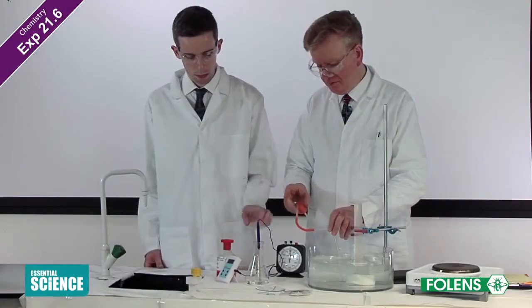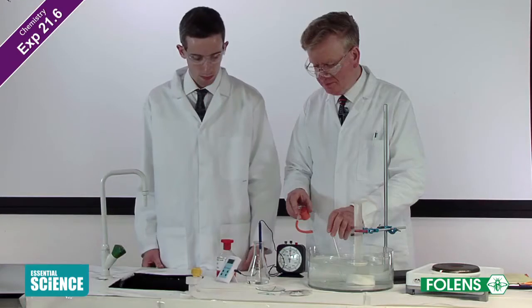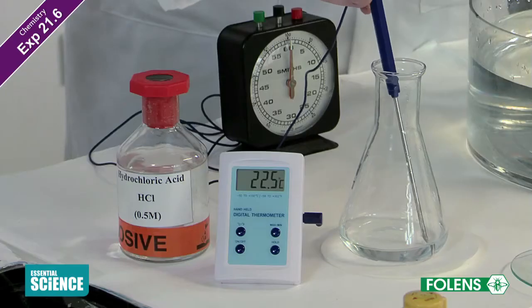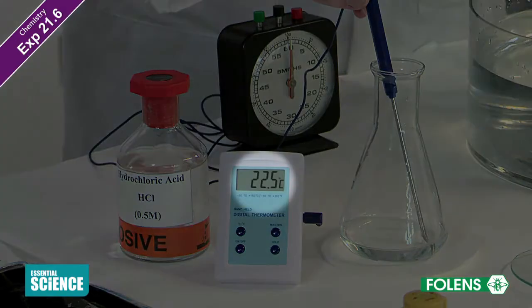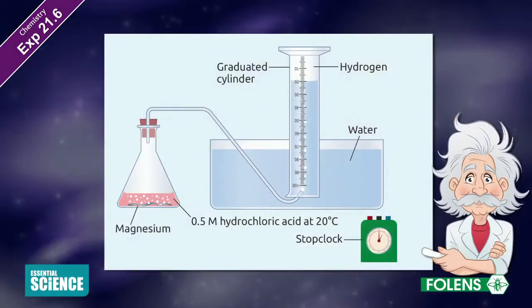Using a graduated cylinder, place 50 centimeters cubed of 0.5 molar hydrochloric acid in a conical flask. Using a thermometer, note the temperature of the hydrochloric acid. Take a length of 6 centimeters of magnesium ribbon. Set up the apparatus shown. Note that we are using a 100 centimeters cubed graduated cylinder to collect the hydrogen gas.